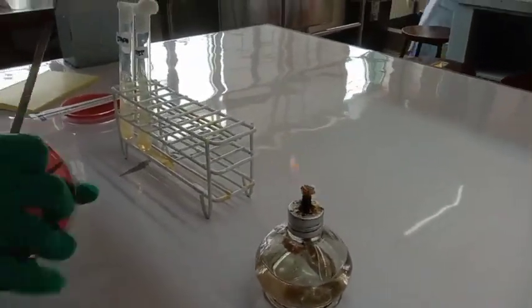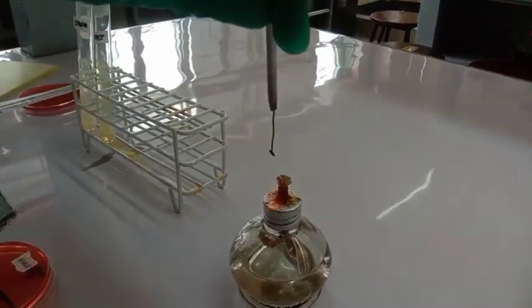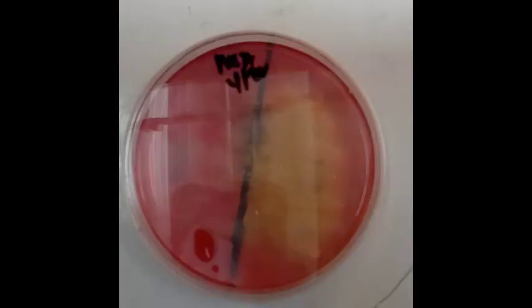After that, incubate the MSA plate for 18 to 24 hours. After 18 to 24 hours of incubation, here are the results. Half of the plate where the Streptococcus organism was inoculated remained pink to red with no yellow halo surrounding growth, which means it is not a mannitol fermenter.